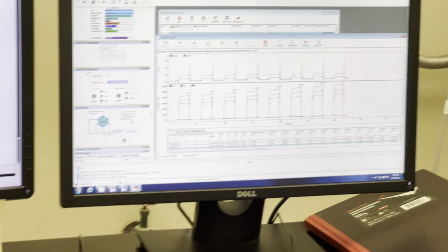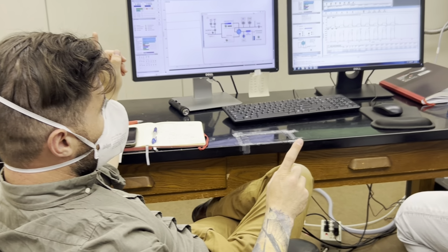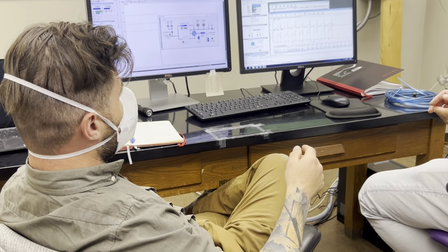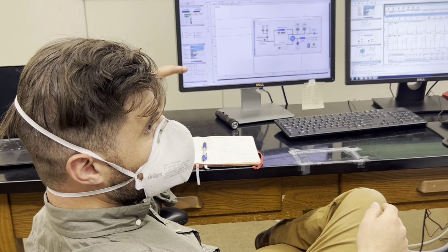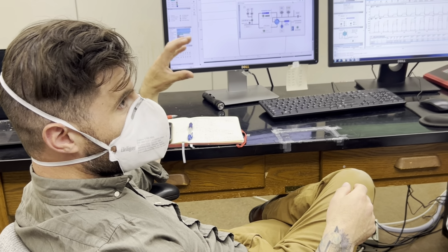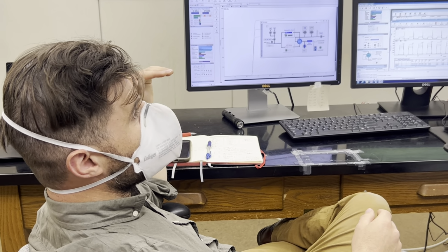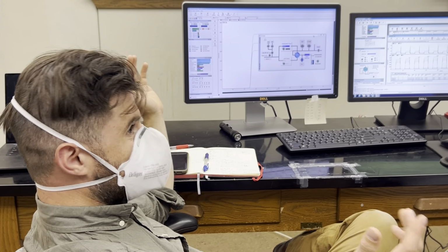And the goal is, you want to make sure, well, not you, but the program will make sure that the isotopic value does not change with the intensity. So you can imagine if you're looking at samples of different concentrations of the standard, if you'd see different isotopic values, that's not right because it's a standard.